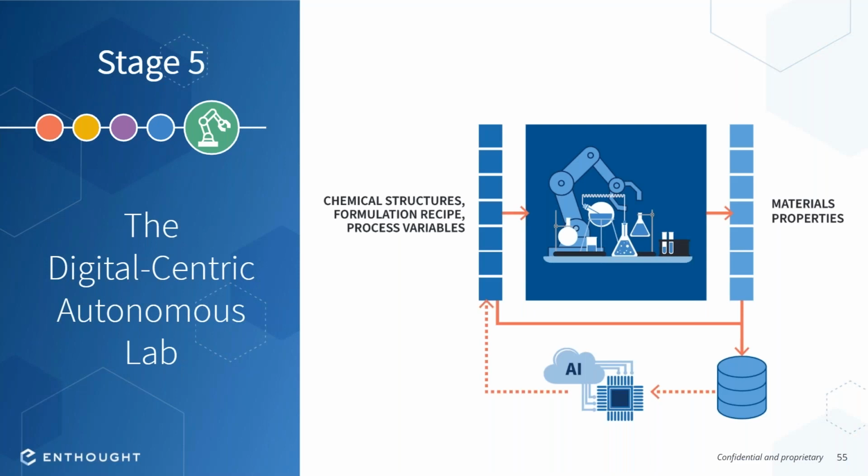So that brings us to stage 5, right? You start reaching a point where now you can start removing the human from this loop here. You can see there's no longer an expert scientist in this loop. You may not do this everywhere, but in some certain places where things are starting to be well understood, you can start removing the human from the loop and allowing these algorithms to take more control as you start to feel more confident in their ability to make good decisions.